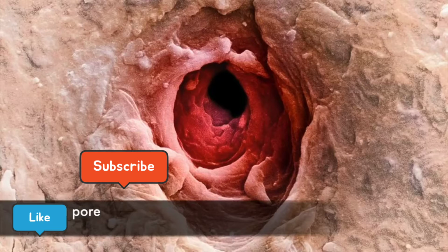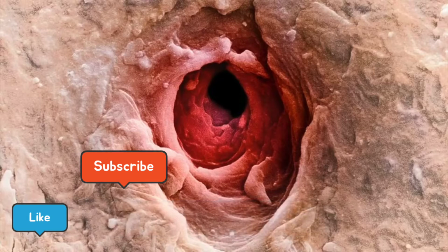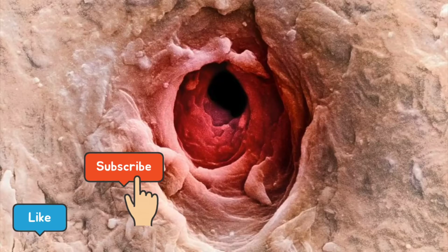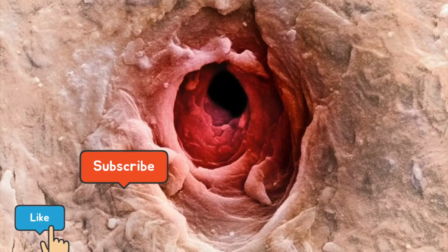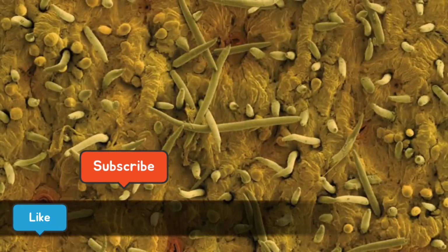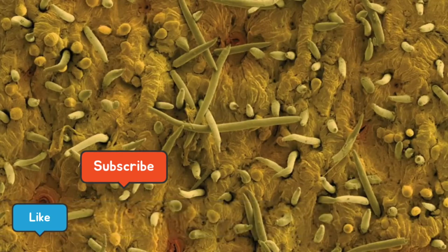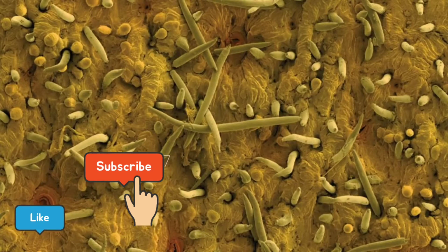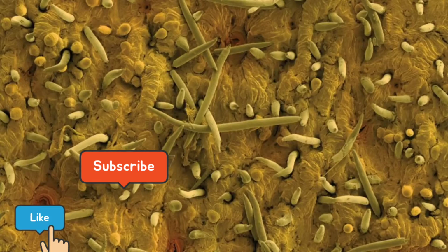A sweat gland pore opening onto the surface of a human palm. Microscopic detail of the surface of a peach. The downy texture of peach skin is due to thousands of hairs, the majority of which are very short. Stomata, or breathing pores, are marked in red.